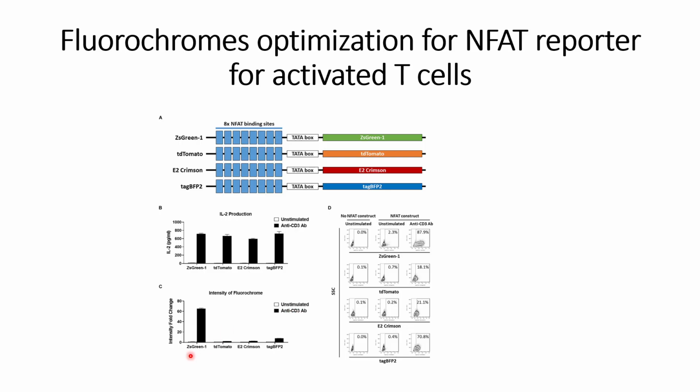We can see that in ZsGreen the fold change is quite high, dramatically high compared to all other cases. Though we can see the difference between activated and non-activated T cells in TagBFP2, ZsGreen gives us the better signals. So they have decided to continue with this ZsGreen reporter protein after the TATA box sequence.